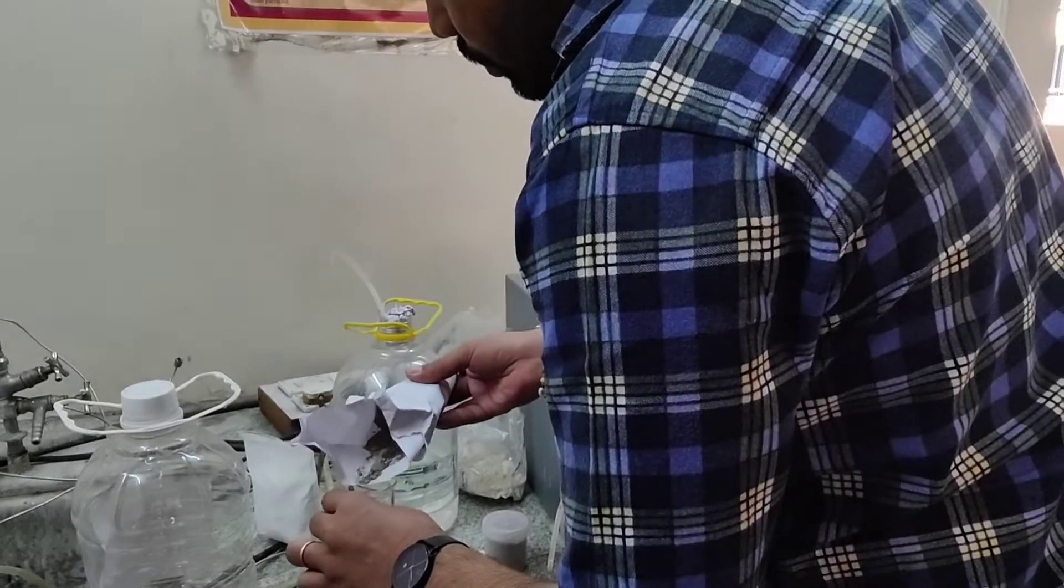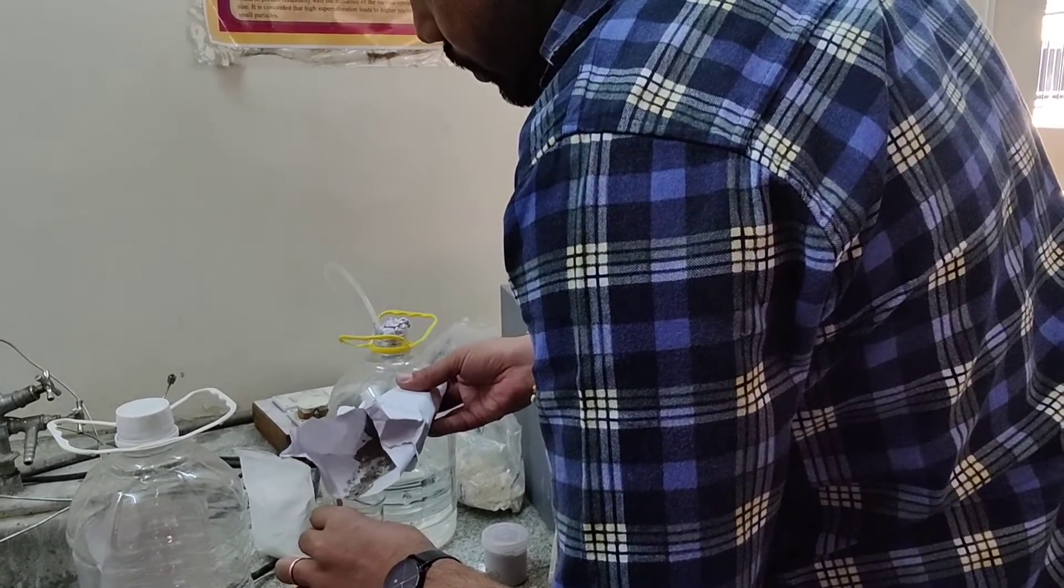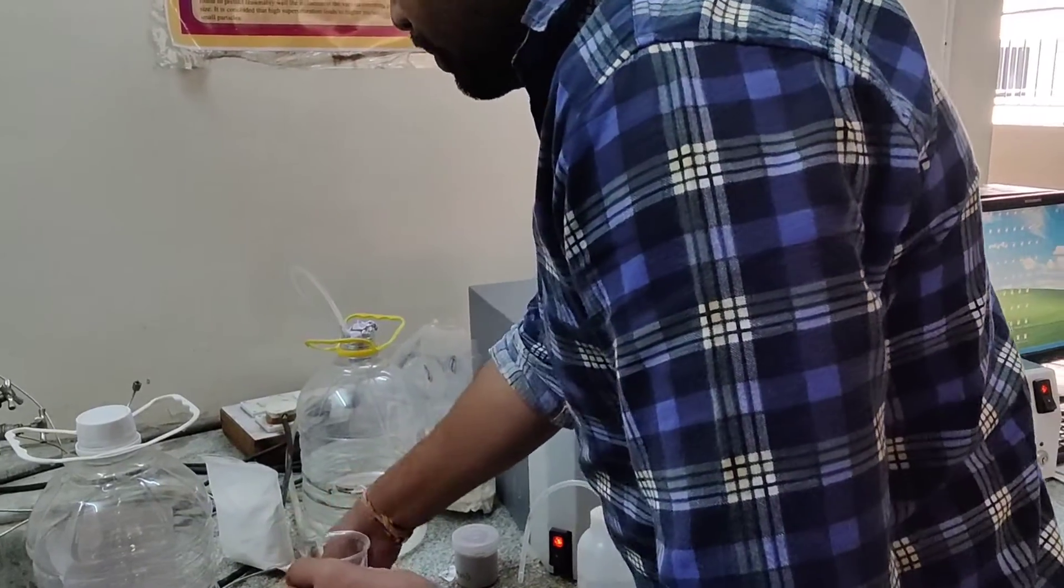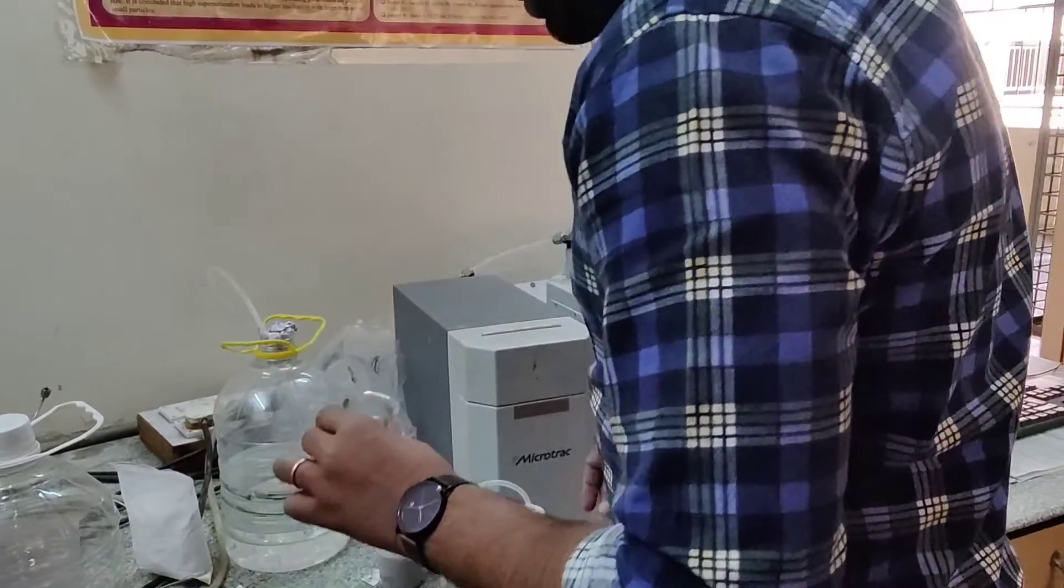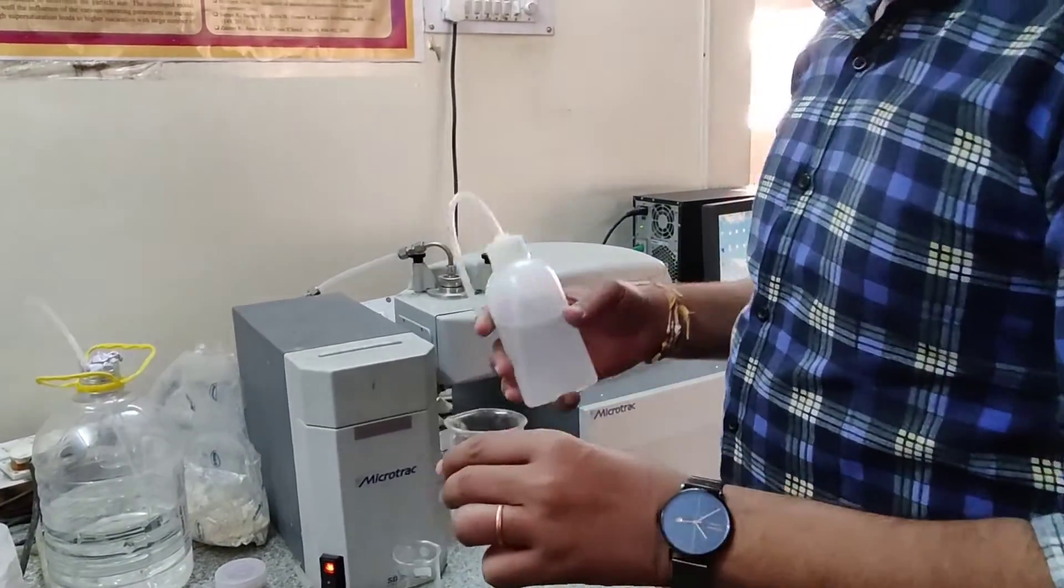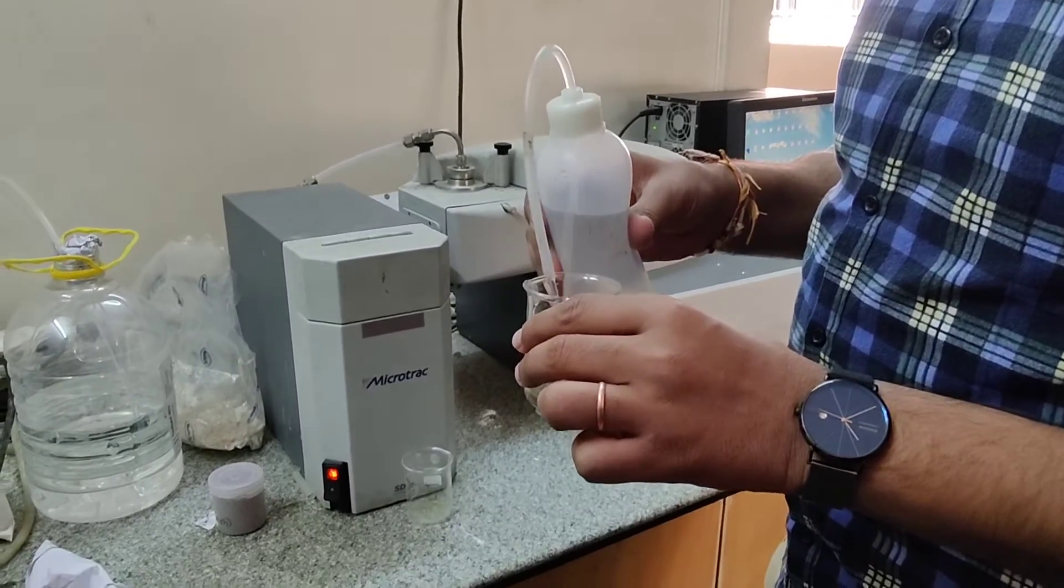The procedure: We take a sample of OPC-53 cement and add distilled water to it and let the particles disperse while mixing in a circular motion.